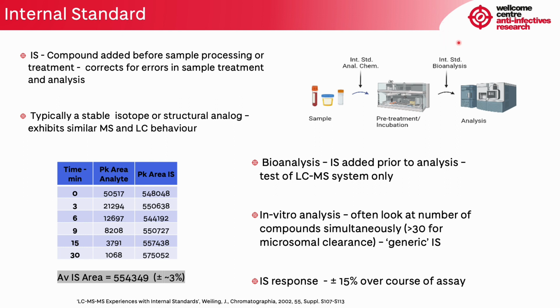In bioanalysis, the internal standard is added after the incubation. In effect, it's a test of the analysis only. Most in vitro assays are performed on tens of compounds simultaneously, and a specific internal standard for each analyte is impractical, so we use a generic compound which is stable analytically.